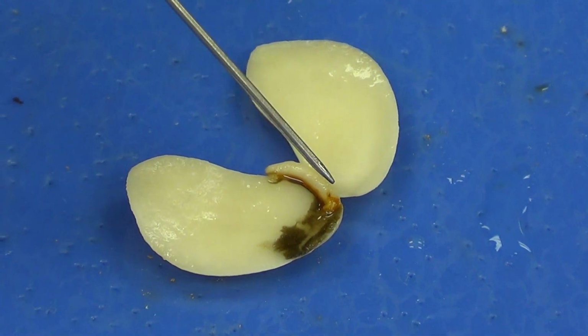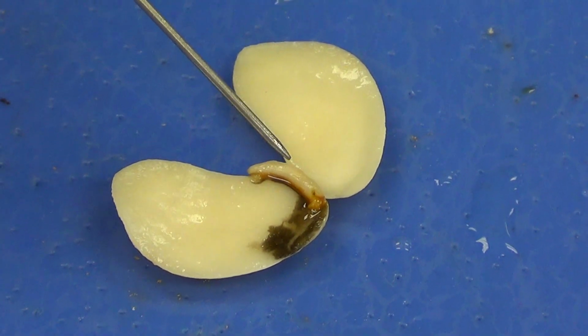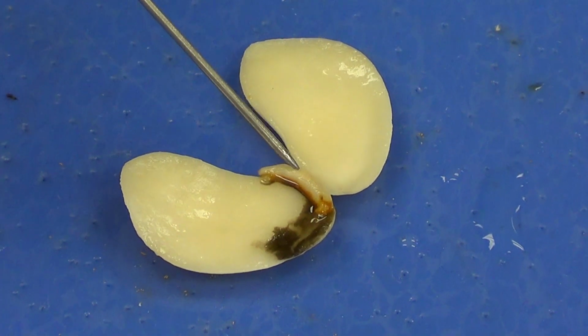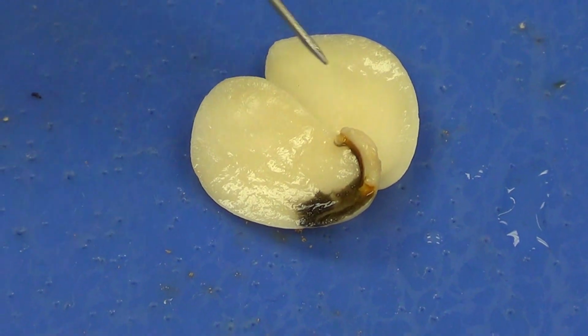This is going to be the epicotyl or plumule. And then I like to divide this into thirds. So that would be the top third. The middle third right here would be the hypocotyl, and the lower third right here would be the radicle, which will develop into our root. And those are the parts of the bean seed that you want to see.